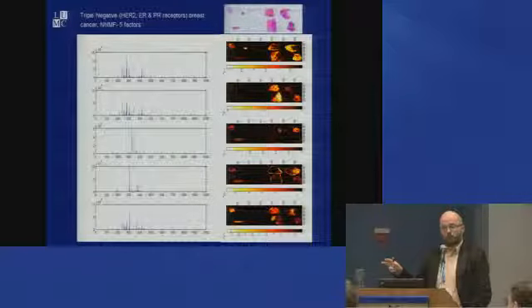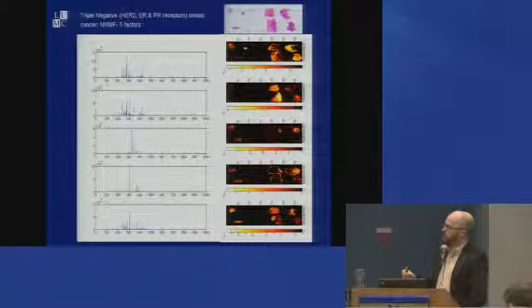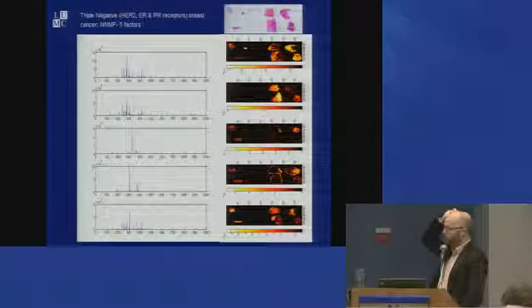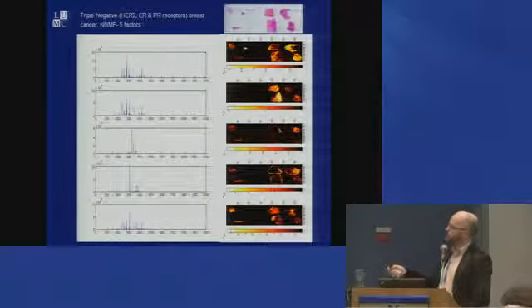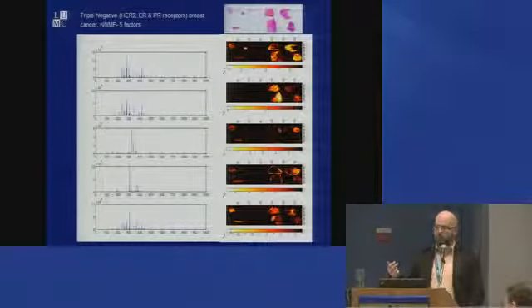There are new tools out there, such as t-SNE, which is probably going to be better than NMF, but I don't have time to go into that at this stage. So what you see here is 5 factors, and here we get the mass spectra in this case, and also the images, which show the intensity distribution of each of these factors.